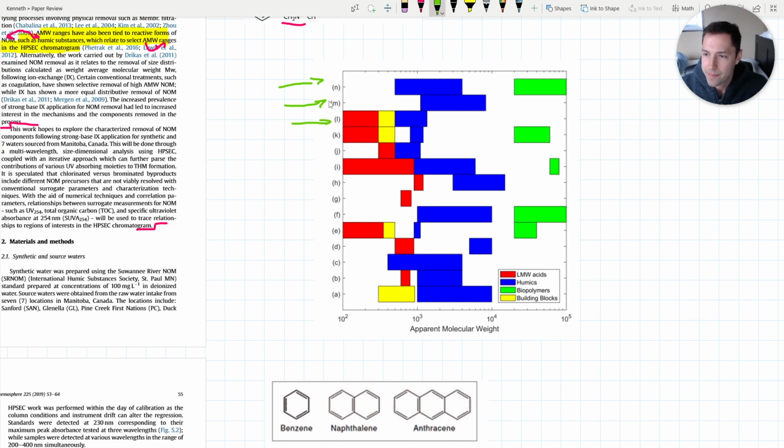Depending on what paper you look at, the authors suggest, if I'm looking for humics, which are humic substances, these highly aromatic, high precursors to disinfection byproducts, approximately what size am I looking at? What range? Depending on the paper, they have different ideas for the appropriate range, but you tend to see something within 10 to the 3 and 10 to the 4, so 1,000 to 10,000.